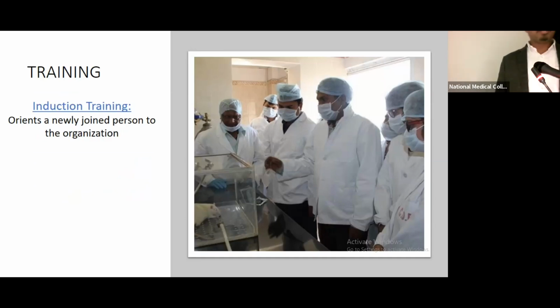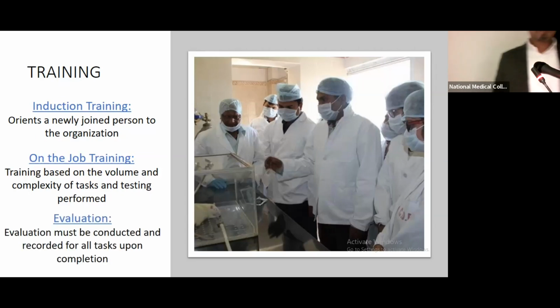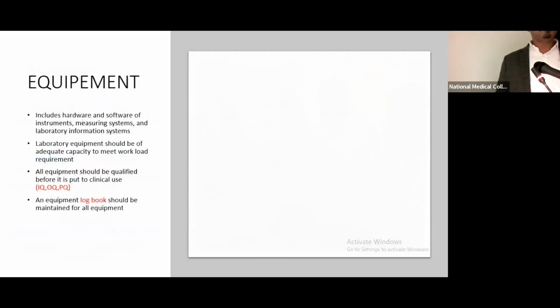So during the induction, when the person has newly joined the project or the institute, he should be trained according to the job needs. And also on-the-job training: whenever there is an improvement or a new facility or new technique implemented, he should be trained accordingly. And periodically, the personnel should be evaluated for their competency. So all these documents need to be maintained.